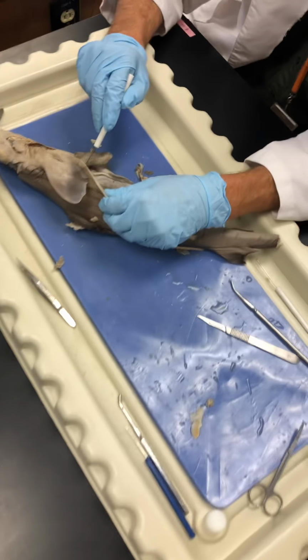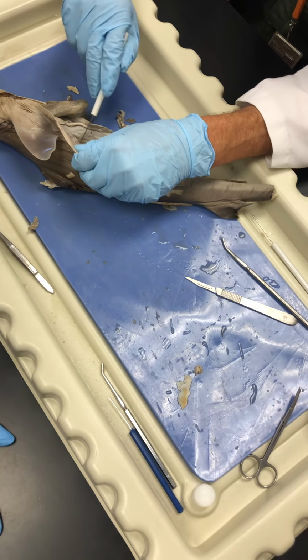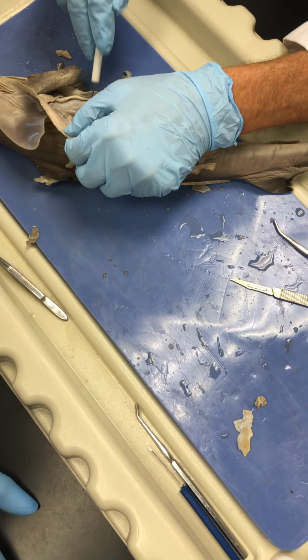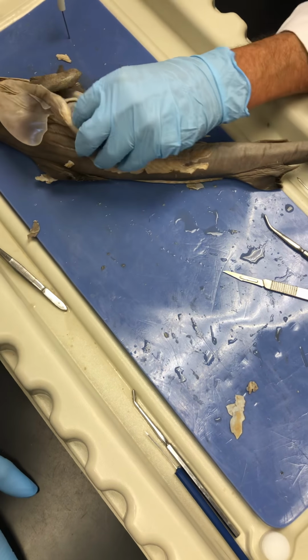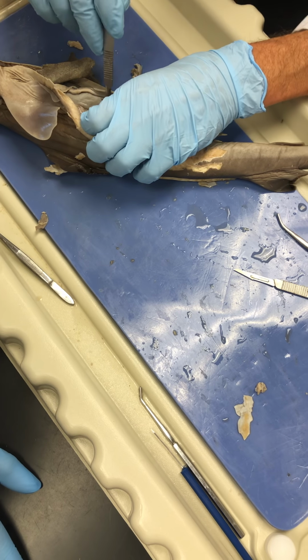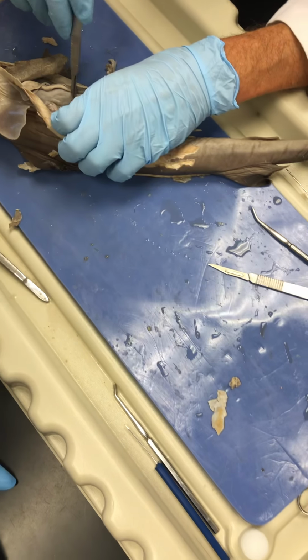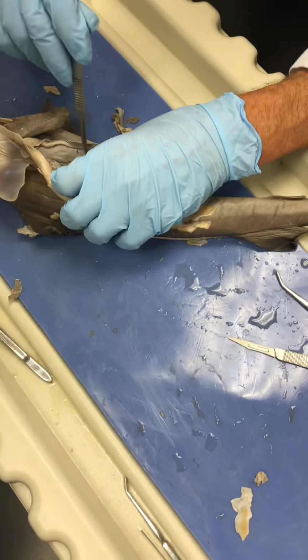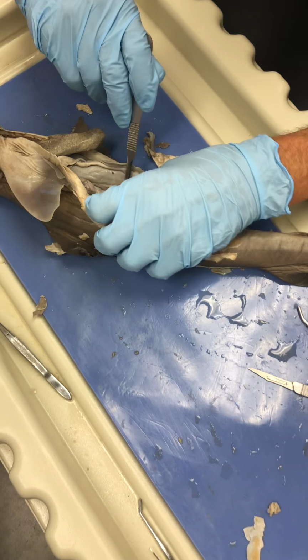Okay, then we go into the large intestine here. We call this large intestine, but we also call it something else, the valvular intestine. And that should be cut open. Or was it the spiral? Spiral, yeah, spiral valves. Okay, here we go.